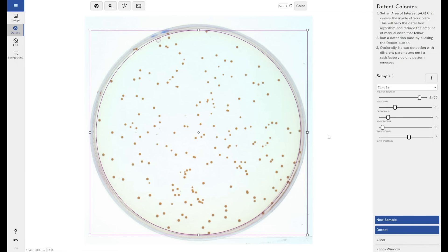That could save an operator a huge amount of time if they had six agar plates that they need to count. They could image them all at the same time and count the colonies all within one click.